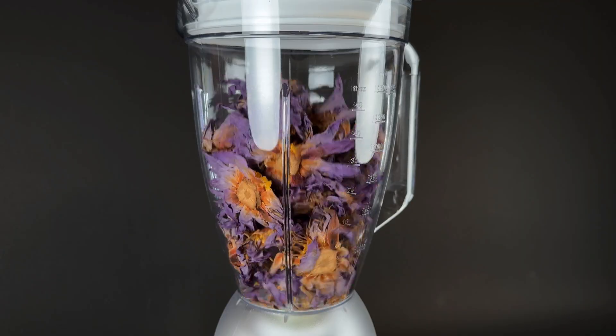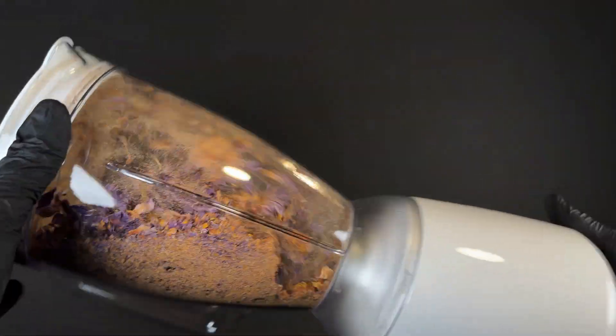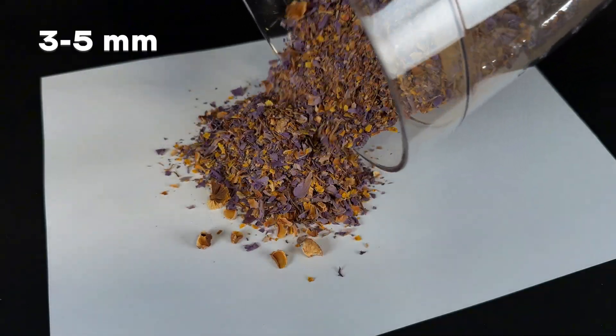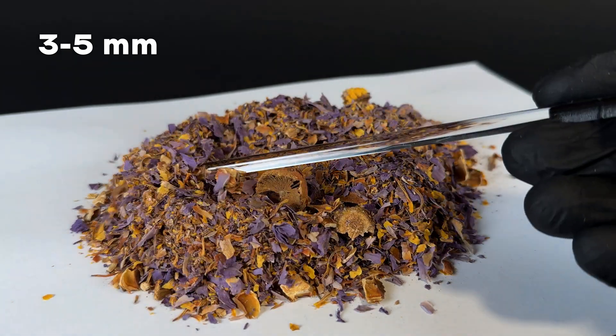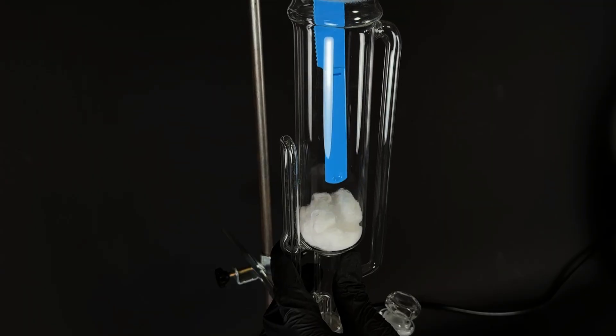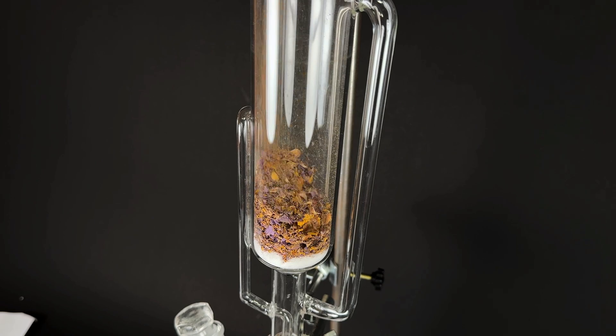Throw the flowers in and grind, but not into dust. If the particles are too fine, they could clog the Soxhlet extractor, making the extraction process a nightmare. The ideal size is around three to five millimeters. I could sift out bigger chunks and grind them separately, but of course I'm not doing that. Place a layer of cotton wool at the bottom, but don't pack it too tightly or it will clog the system.